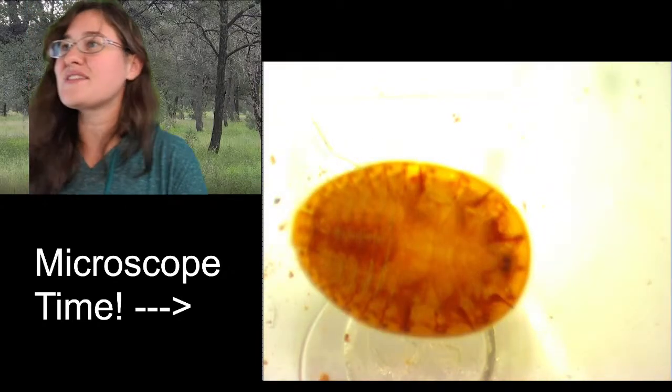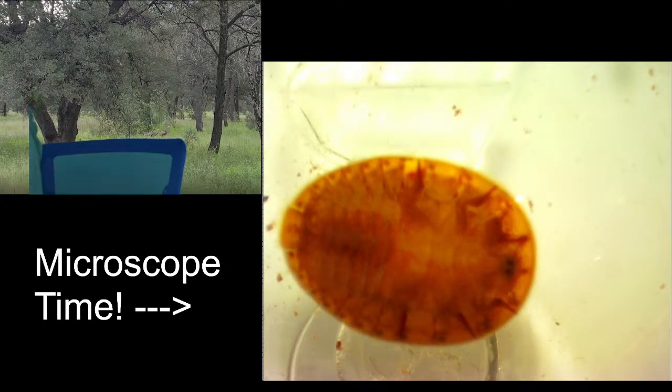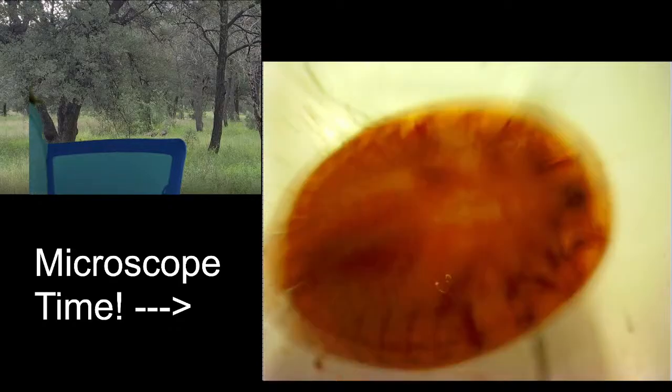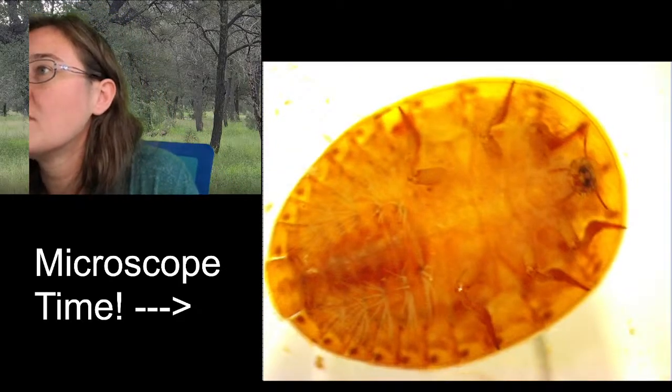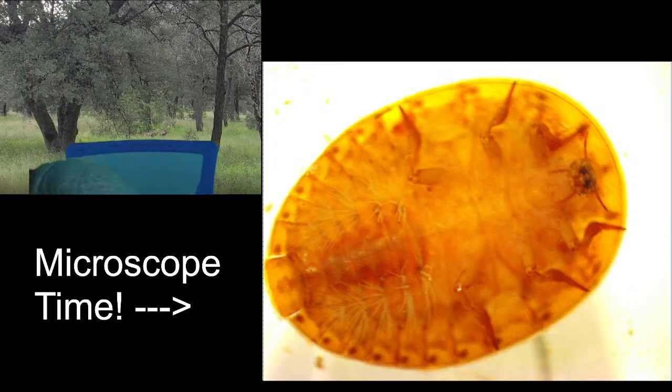So this is what he looks like from the bottom. Look at his little face.